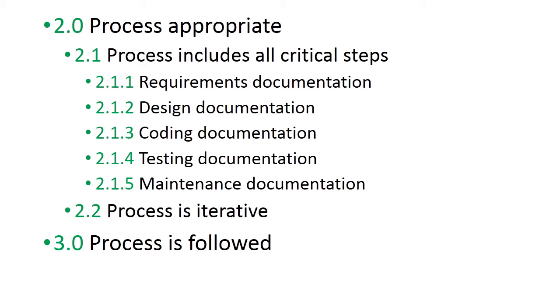Next is the testing document. Once the coding is done, we have to test the prepared software. So what would be the procedure for testing this newly prepared software? It should be documented properly. The last point says maintenance of documents.